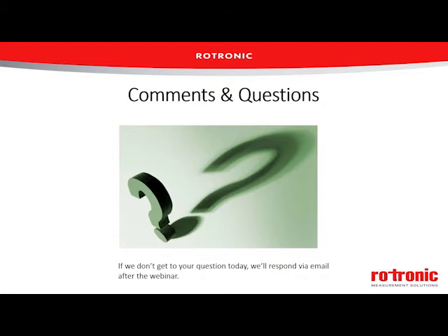Well, two things on that. If you go and look at the charts that have been published for the relative humidity that saturated salts will generate, they do actually change over temperature. So the saturated salt solution will stay fairly close, but many of them will actually change as the temperature changes. So it's a little bit false that they don't change over temperature because there can be some change.